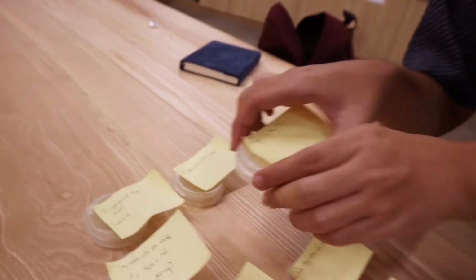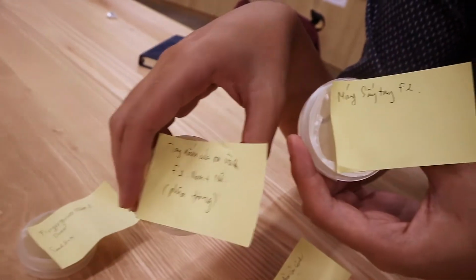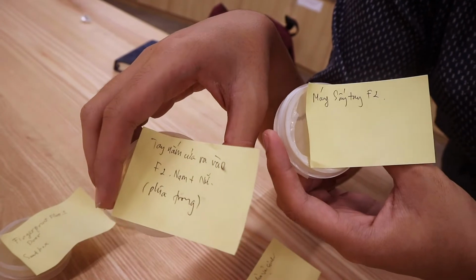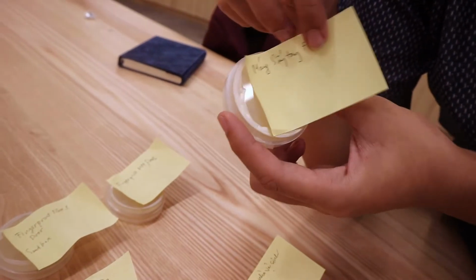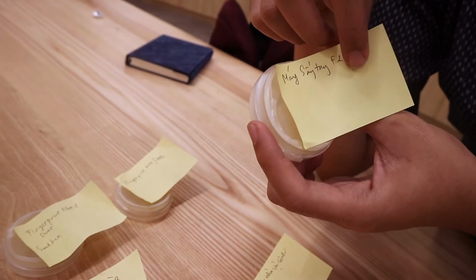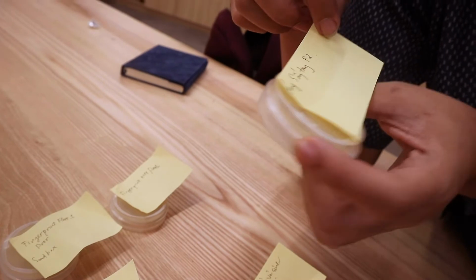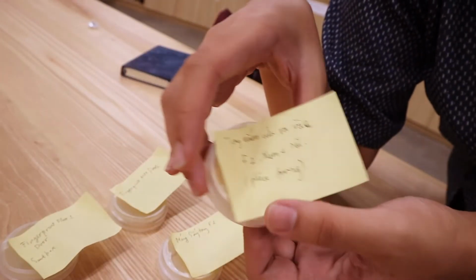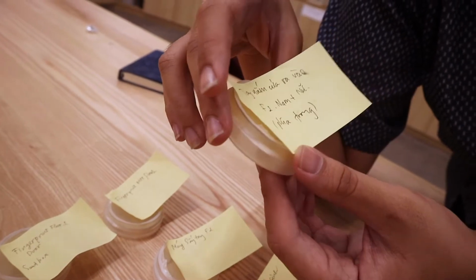Okay? So these are the 2 dishes we collected from the same place, from the bathroom on the second floor. This is from the air jet, or how you call that, the blow dryer, the thing that you put your hand under. And this is collected from the doorknob of the entrance door.